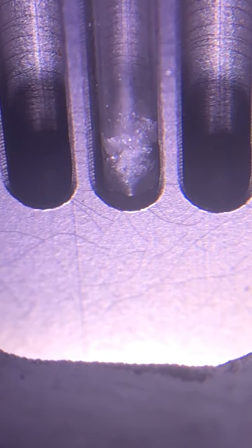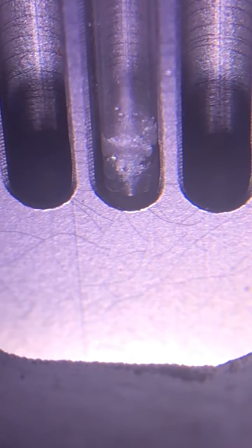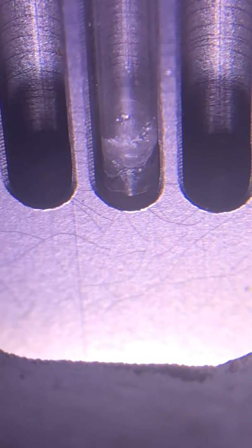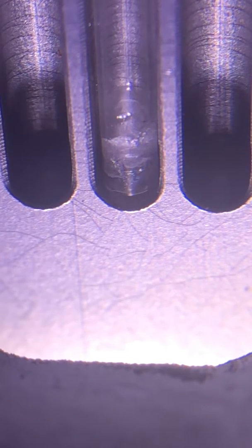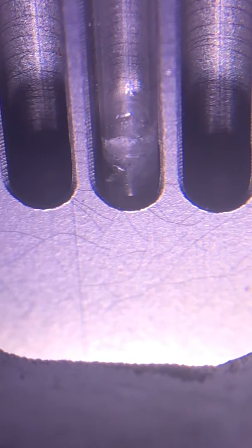This is 121.6. We're at 122 and what we're looking for is the clear point when the entire sample melts. It's a little hard to see in this view actually.